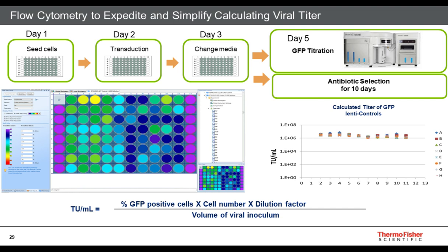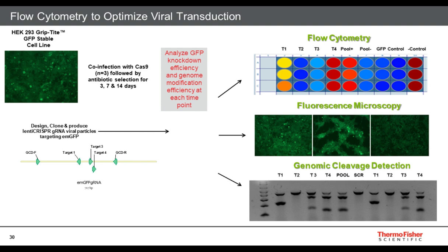The GFP titering as a sentinel was so much faster and saved us countless hours and really money, in order to check any plates, doing a QA check before we move to the next step of viral production, which is very handy. So you can really get creative and use it in a lot of different ways.